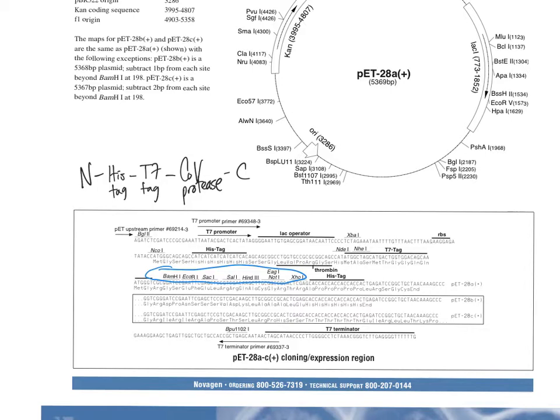Okay, now I don't want to let it get down. You can notice that there's a stop codon that we could use here, but we don't want that. That is extraneous sequence and a His tag that I don't want. So I don't want any of this. And so I'm going to say that the better way to do this would be to put a stop codon at the end of this. And so we can actually engineer in a stop. So it will truly stop at the C terminus and be done. And so this is how we're going to do it.